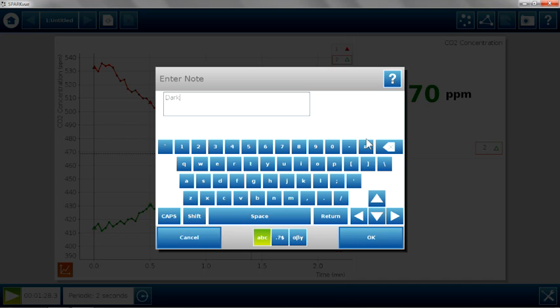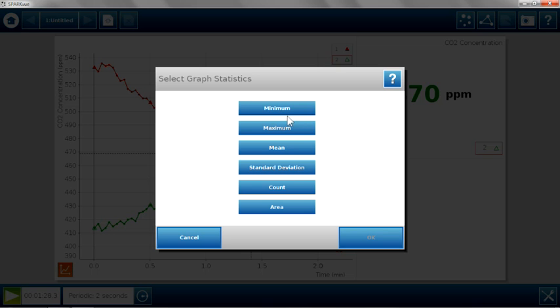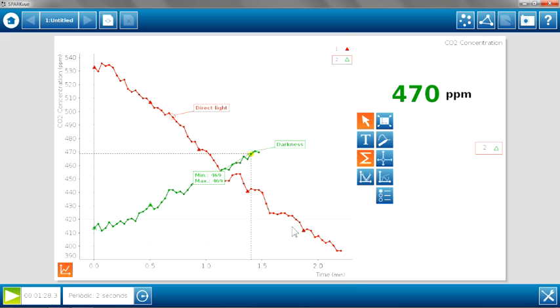And I could use the same statistics tools of minimum and maximum to find the change that occurred during the time period. Or I could also do a linear fit and find the slope and compare the slope for the change in CO2 in the darkness compared to the rate of change in the light.